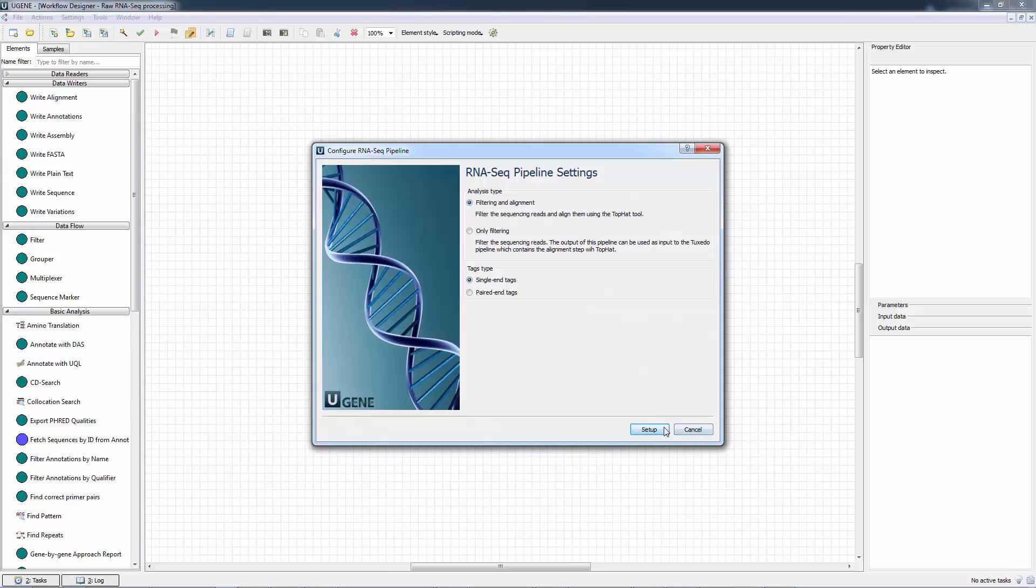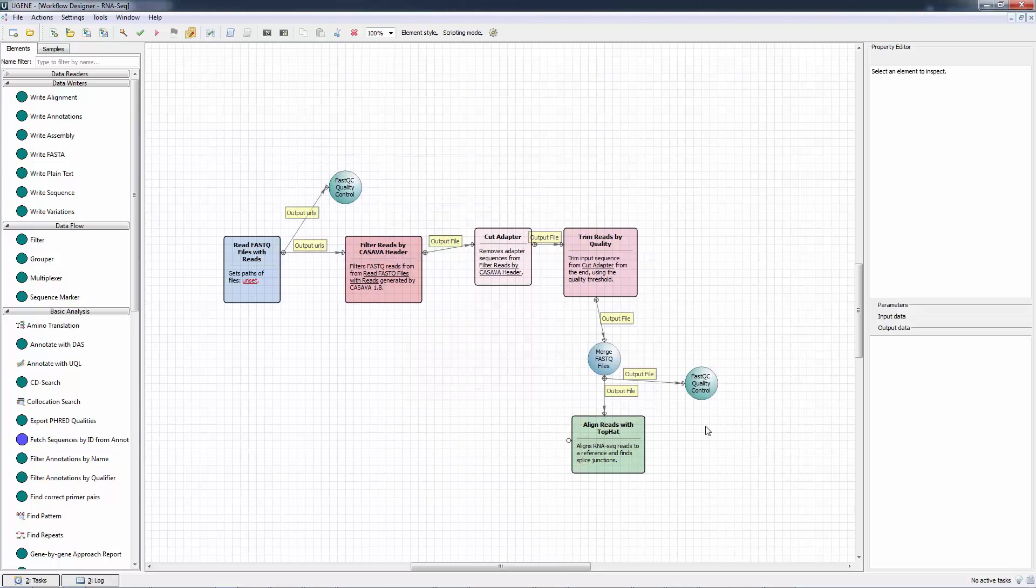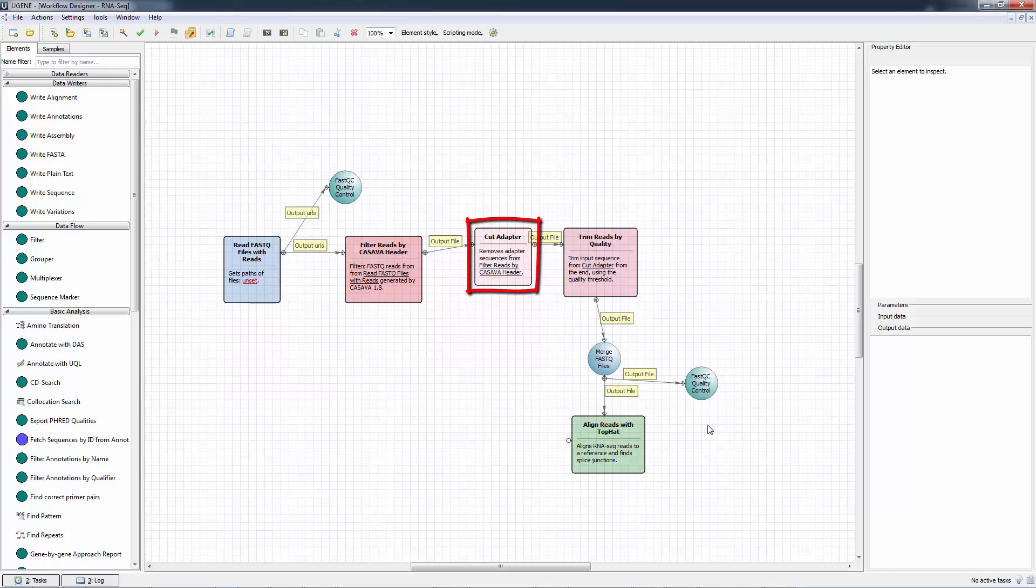Another tool added to the workflows is CutAdapt, for cutting the adapter sequences from the sequencing reads.